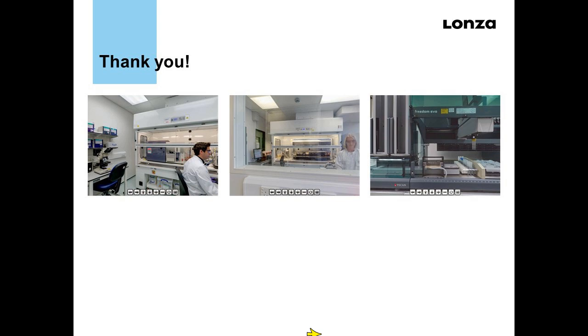So without automation, automation is the real driver here behind why we can actually screen so many clones. Without automation, screening large numbers of clones for product quality analysis just wouldn't be as possible. To give an example, our traditional manual 2AB labeling process takes 3 days for up to 12 samples, whereas we're looking at about a day and a half for the automated purification for up to 96 samples and 2AB labeling for samples plus controls.